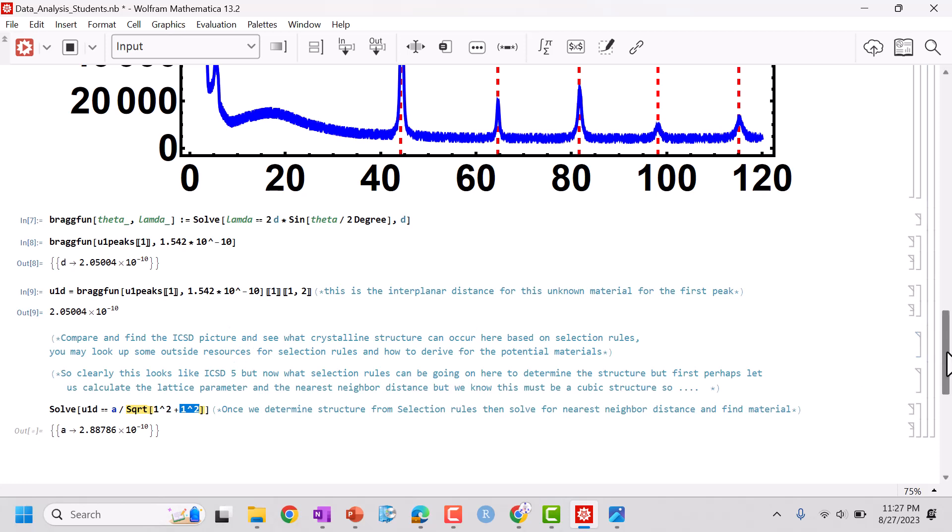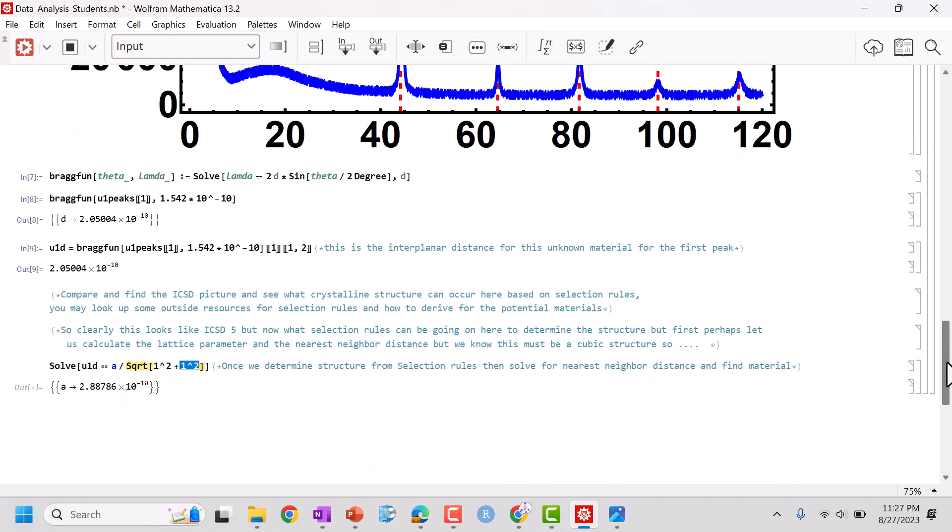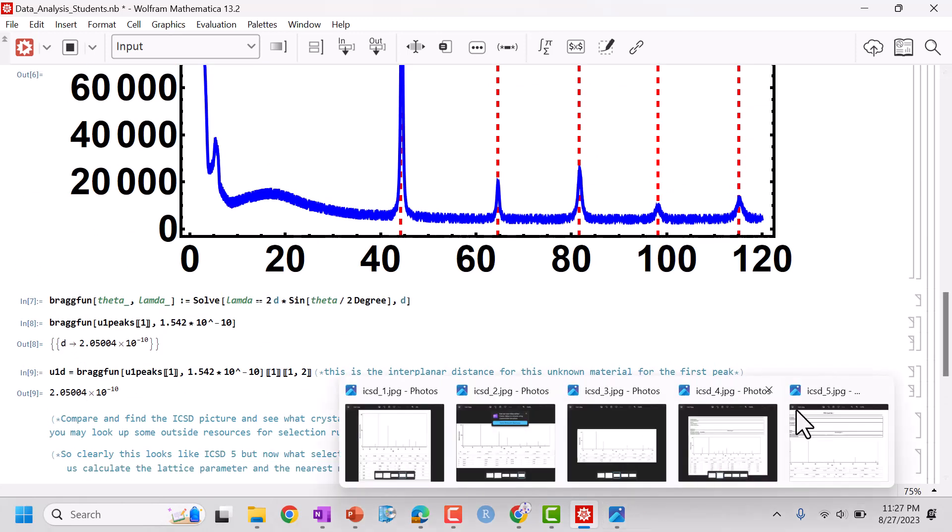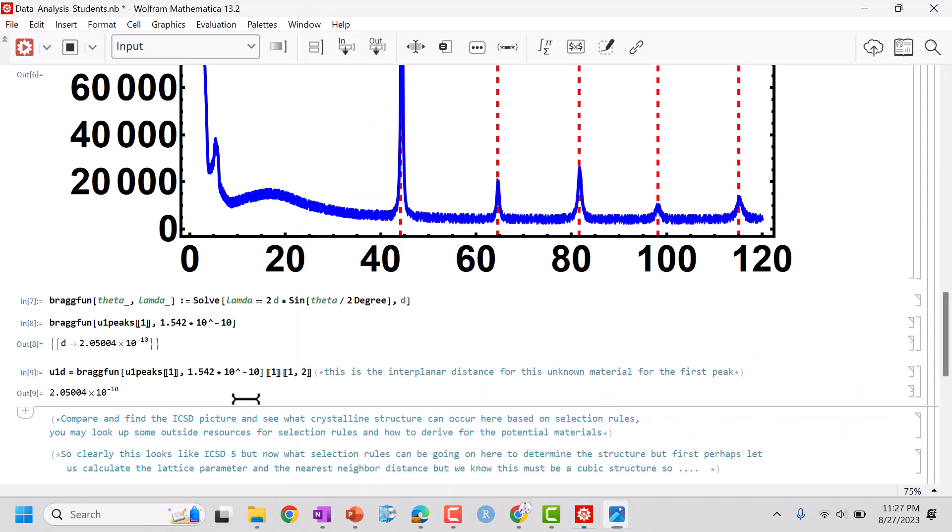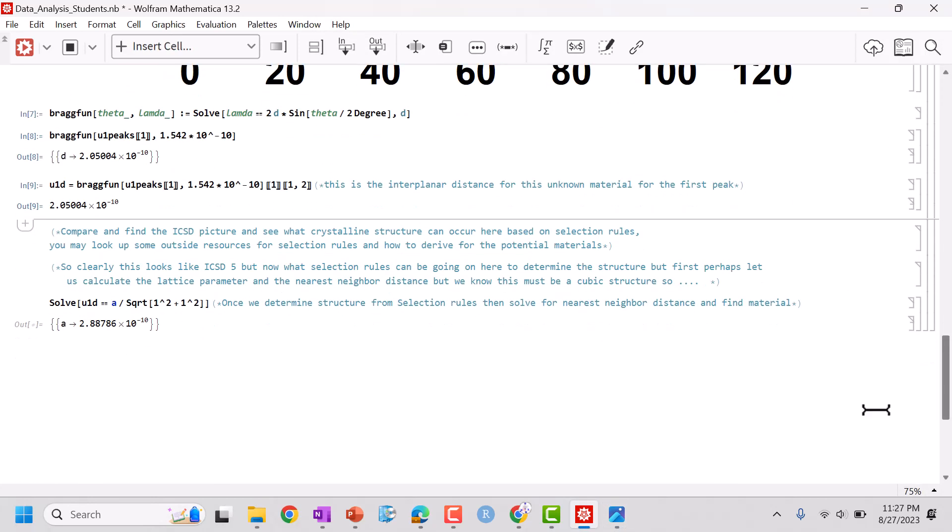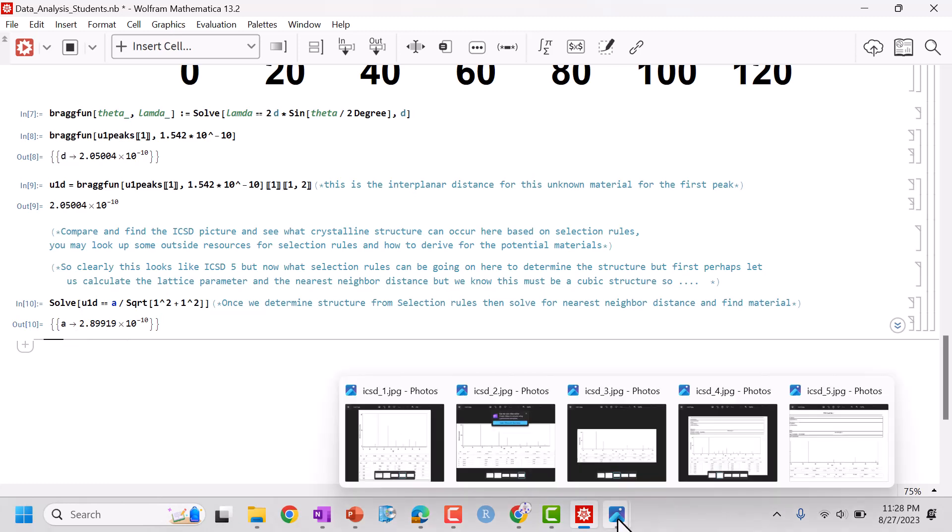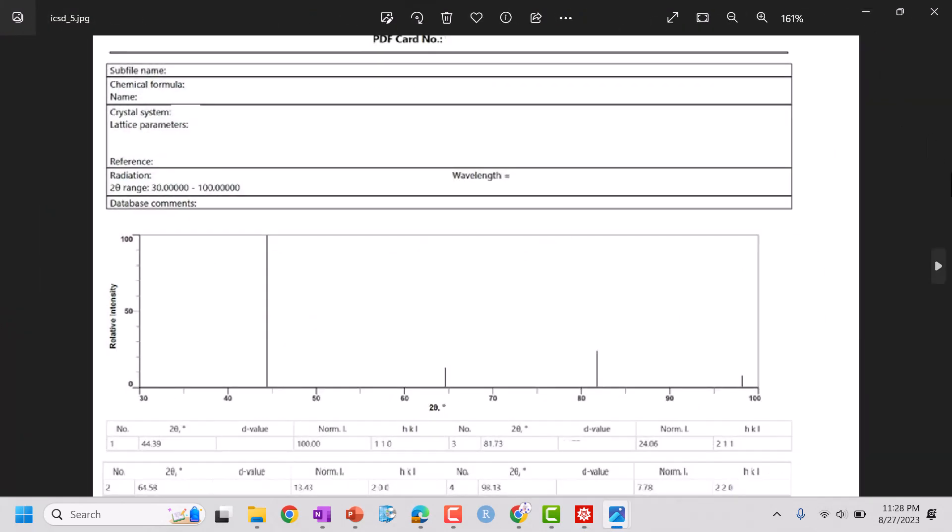Now to use and solve for my lattice parameter, I need my HKL indices. We matched it with Material 5 so we can actually just go ahead and proceed with this calculation. First peak has HKL indices of 1, 1, and 0. We know all the materials that we're working with are cubic, so I can actually go ahead and proceed with solving for my lattice parameter. So that's 289 approximately.